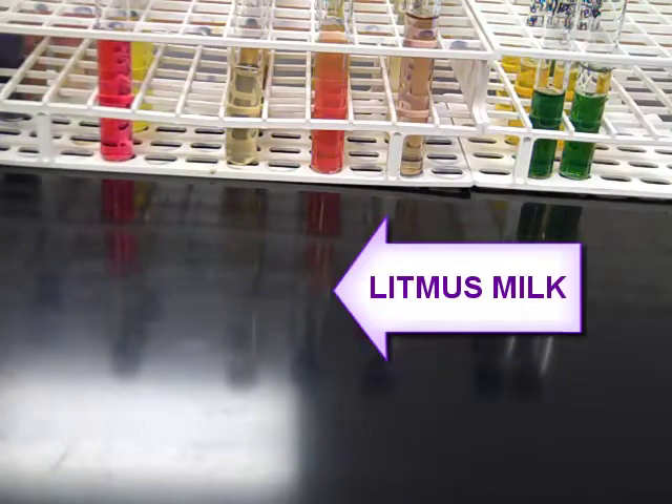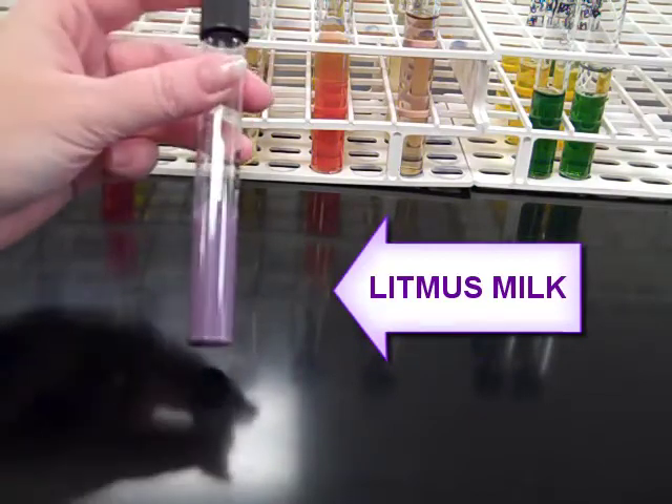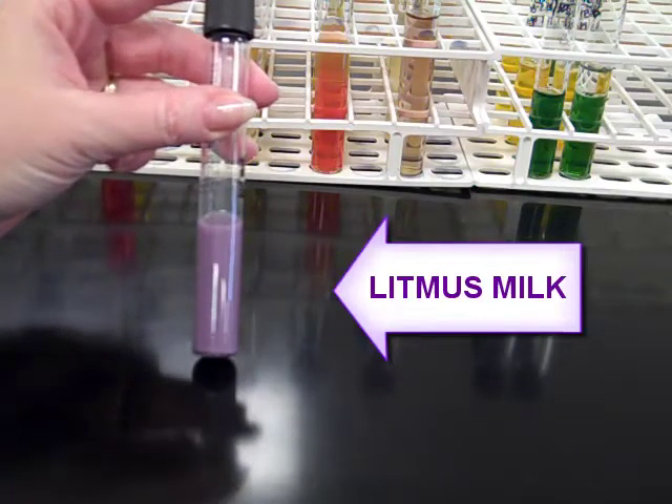We're going to check out the tube media for microbiology. First we're going to start with litmus milk. Litmus milk is a nice purple color when uninoculated. The color of the tube ultimately is an indication of whether or not the organism is able to ferment lactose.